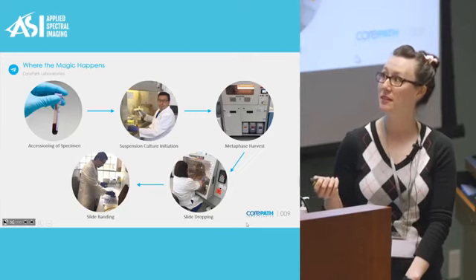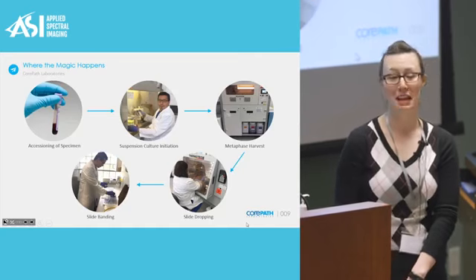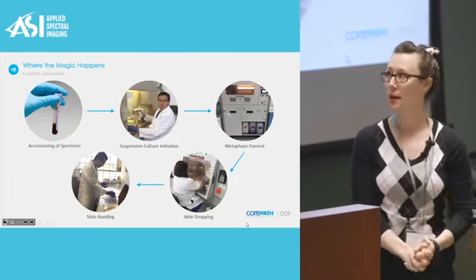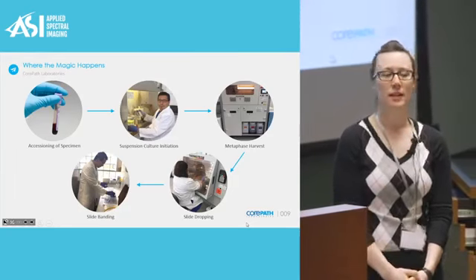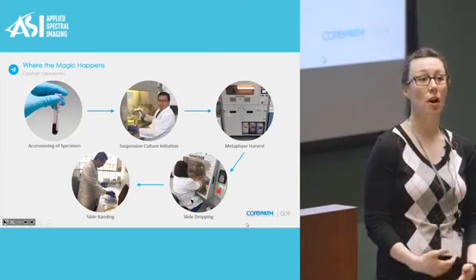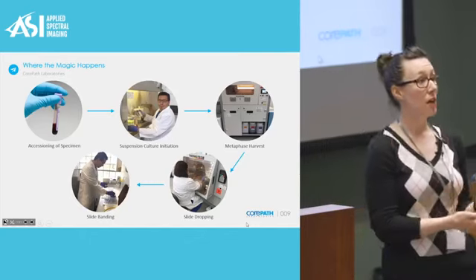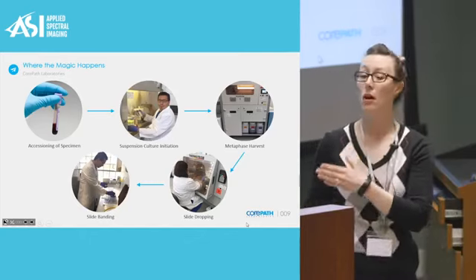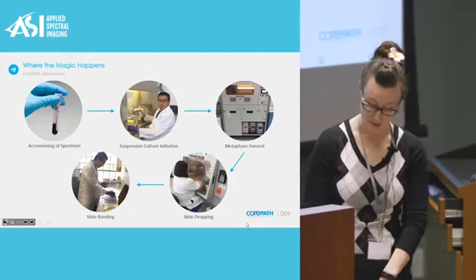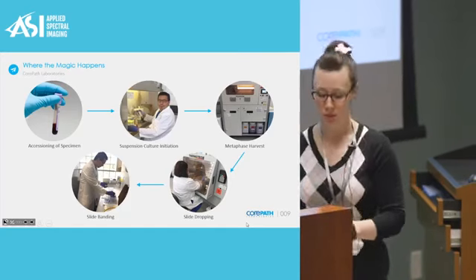Now, I don't know if any of you have seen an automated harvester, but these are going to be your best friends. We like to call her Hannah because her name is Hanabi. She is a piece of equipment that's relatively new to our lab, and she greatly increases the efficiency and consistency of our cytogenetics laboratory. It allows consistent harvesting. It allows efficiency for our lab to increase by freeing up technologist time to do other things while our harvester is harvesting our specimens. It's a pretty unique and amazing piece of equipment. And this is one of the first stages where you can see automation stepping into our laboratory.